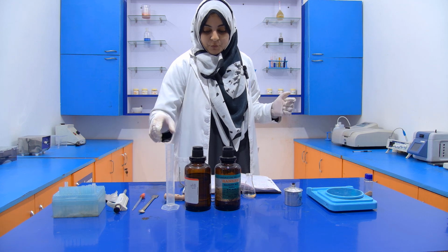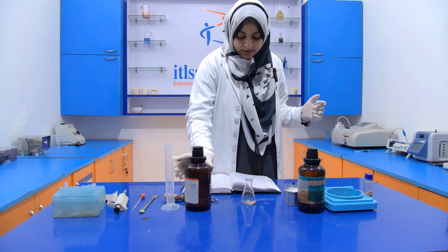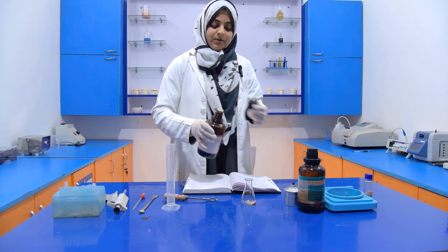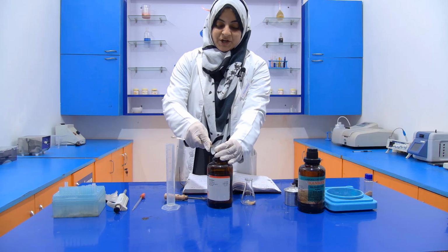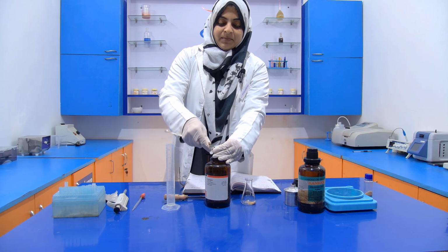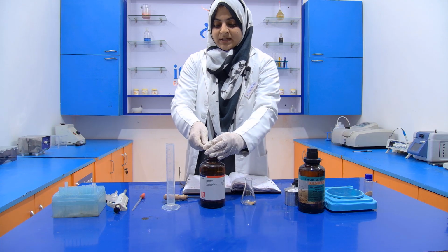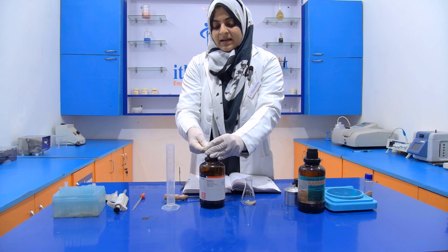Now what we have to do, we have to add 10 ml of this acetic anhydride into it. Then after that we heat it gently. Then after heating it with the help of this burner, we have to add 2 drops of this concentrated sulfuric acid.